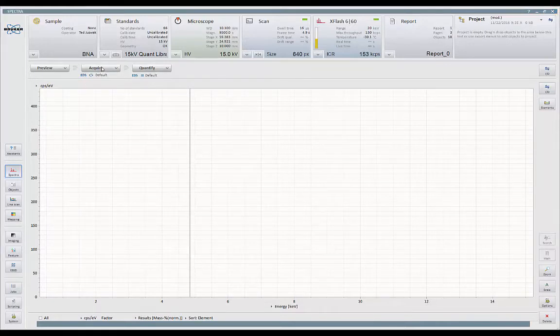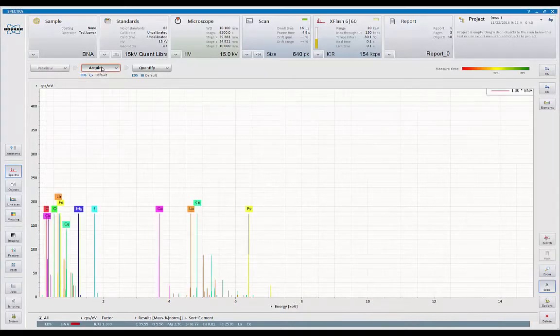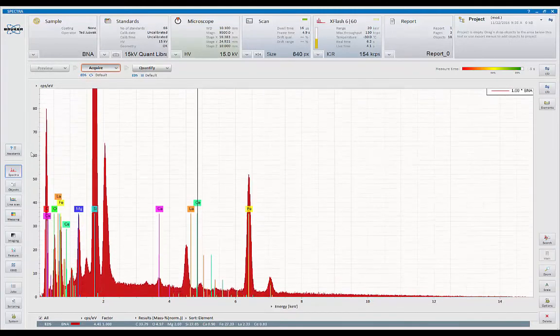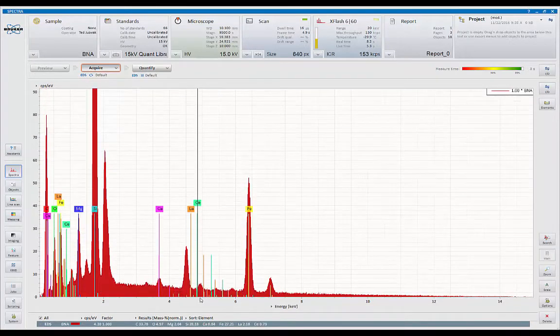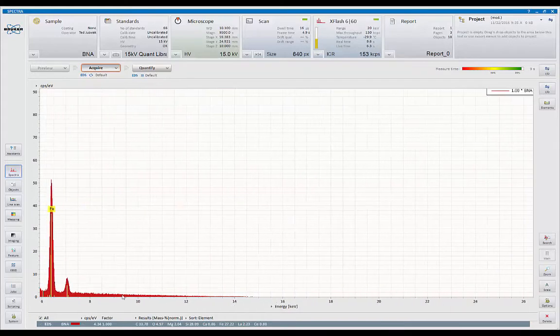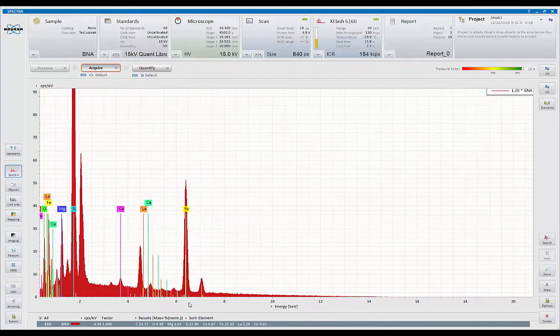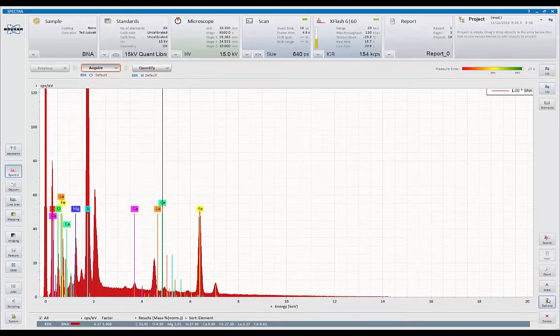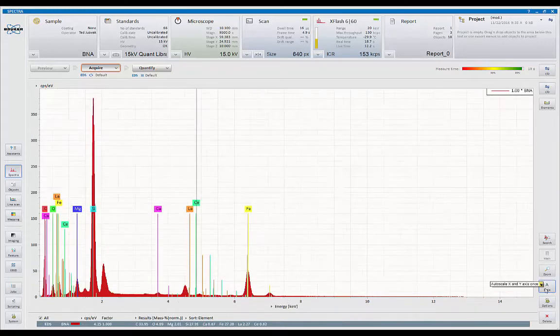So when I press Acquire now, that starts the acquisition. I'm currently in manual mode. Over here I can pick up any of the axes, so I can slew, move them up and down, maintaining the gain that I've set. A is the automatic vertical and horizontal scale. Click that and adjust the system to its maximum height.